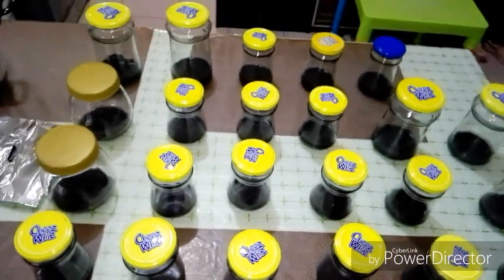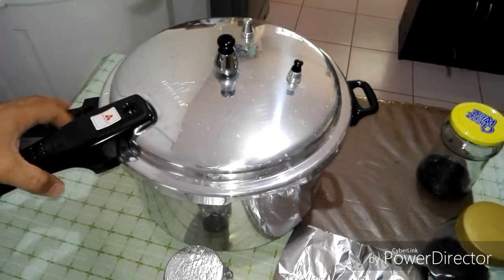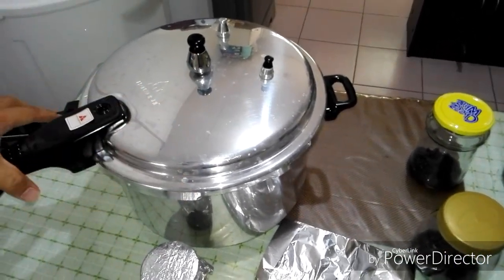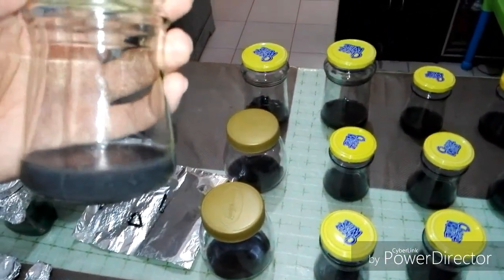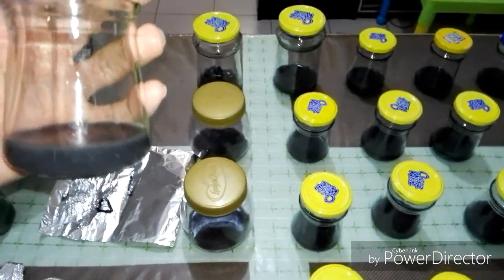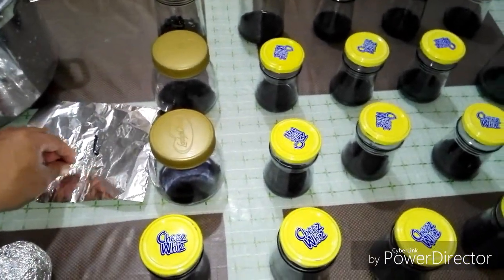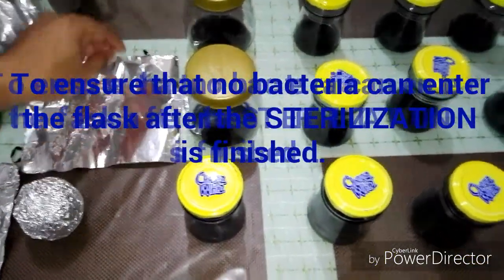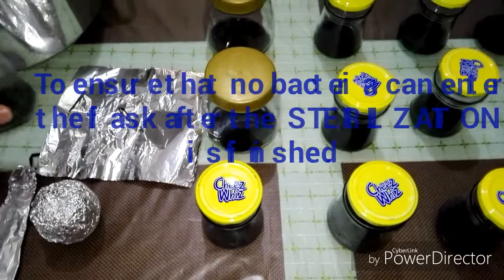For sterilization I will use a pressure cooker right here, and the flasks will be put inside for about 30 minutes — that will be enough to kill the bacteria inside and minimize contamination. Before we put the flask inside the pressure cooker we have to put aluminum foil on the top of the flask, along with a rubber band, and it will look like this.